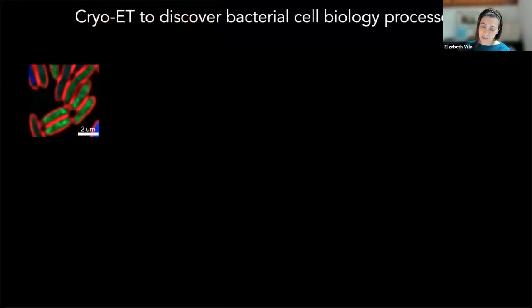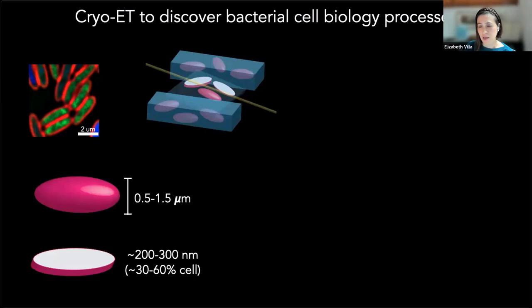Whereas bacteria has a little bit of the opposite problem, where in mammalian cell biology, fluorescence microscopy gives these stunning images where you can really localize in subcellular compartments and things like that. Bacteria are very, very small. And they're really just one order of magnitude larger than the diffraction limit of light. And therefore, doing bacterial cell biology live imaging is typically kind of difficult.